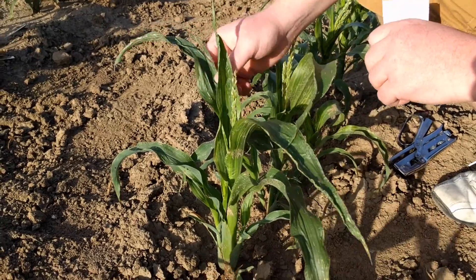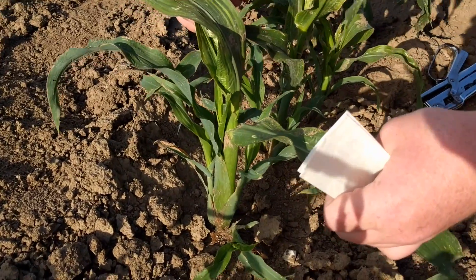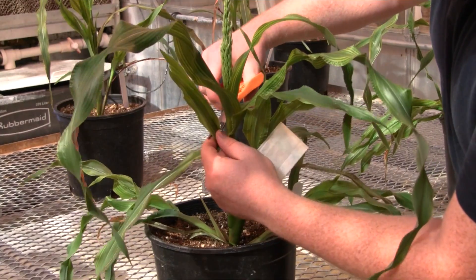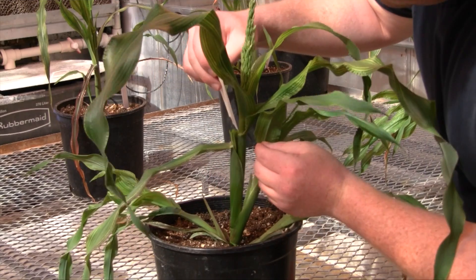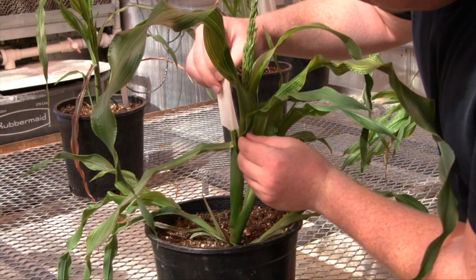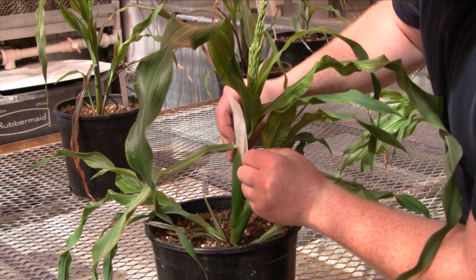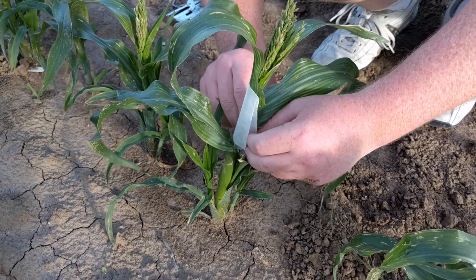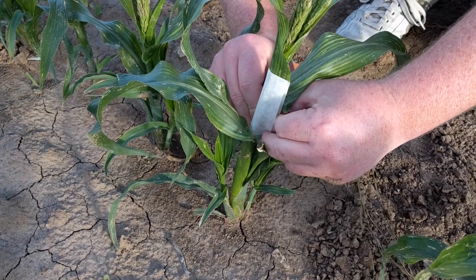On a mini maize plant, the ear will generally emerge from the node of the fourth or fifth leaf from the top. If the ear flag leaves are long, they should be trimmed back to about one and a half to two centimeters. Place the side of the shoot bag with the longer tab against the stalk of the plant and slide the tab into the leaf sheath between the flag leaves and the stalk. If the flag leaves are small, pull the tab side of the earshoot bag firmly around the stalk so it does not catch on the flag leaves and crumple them.